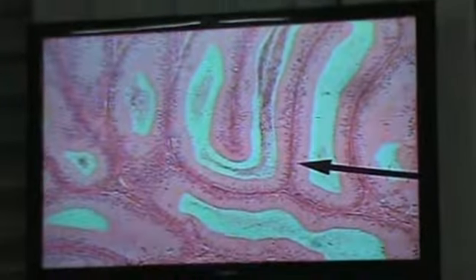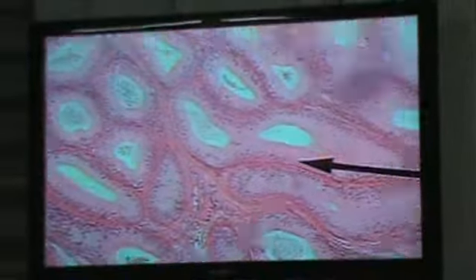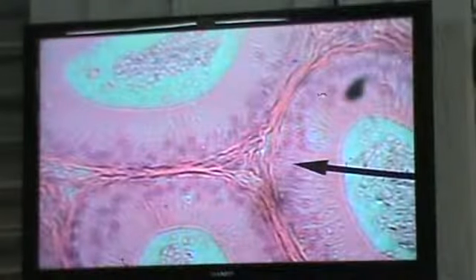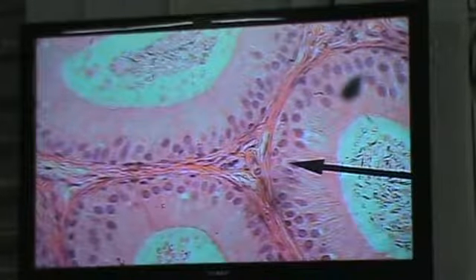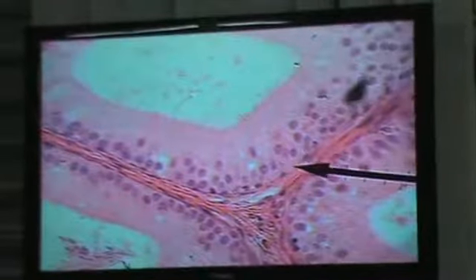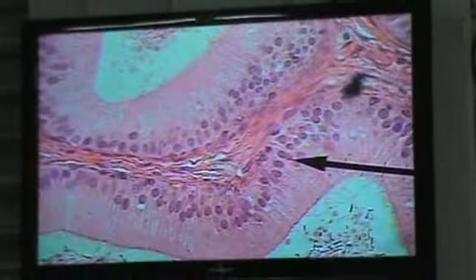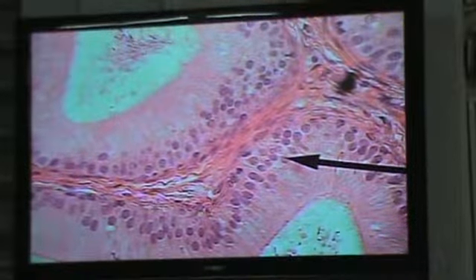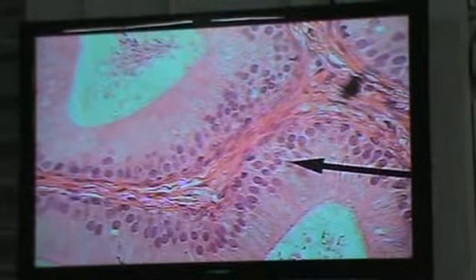Alright. Okay, there. Beautiful. Okay, now some good spermatozoa. Okay, so this is very nice. So this type of epithelium here is what? Pseudostratified columnar with stereocilia. Okay? And there's smooth muscle surrounding these tubes. Right? So the duct of the epididymis has smooth muscle, and we should see spermatozoa. Alright? We should see spermatozoa there.